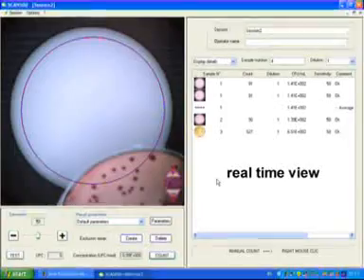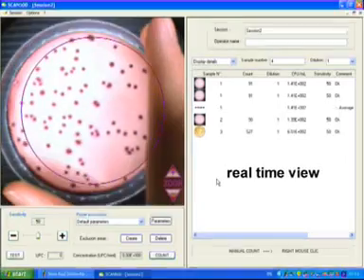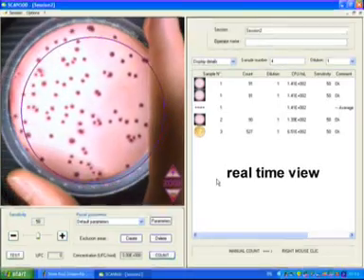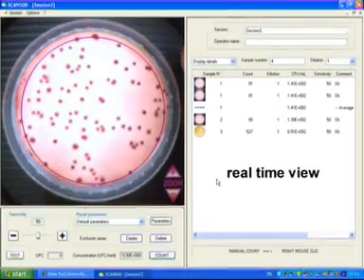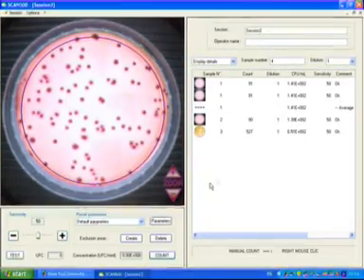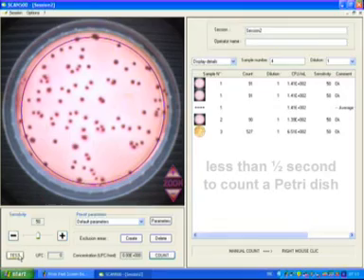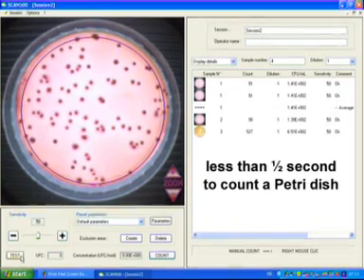Place your petri dish. Scan500 displays real-time views. In less than half a second, your result is available.